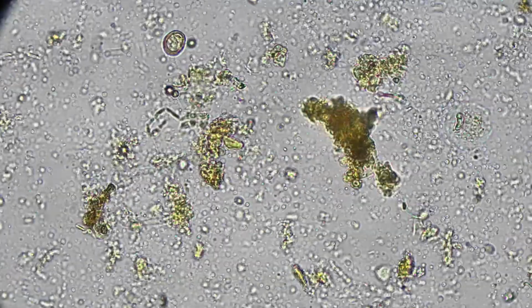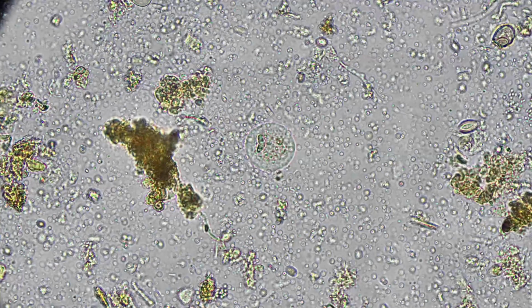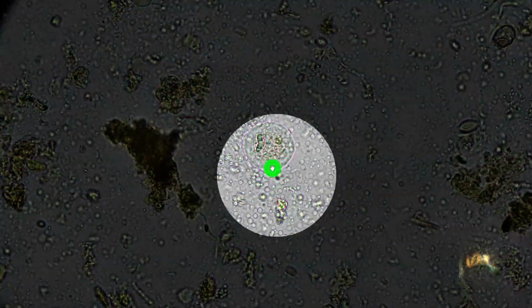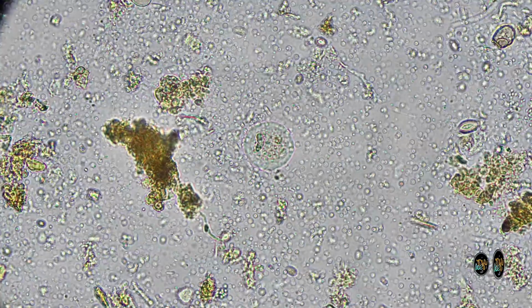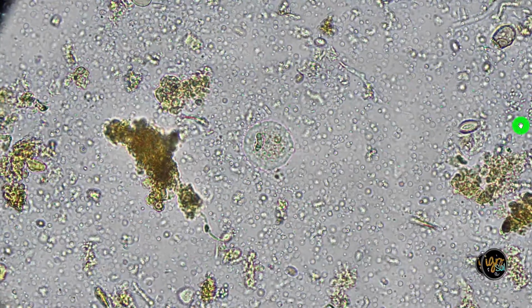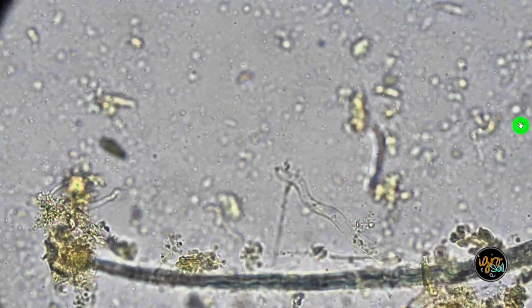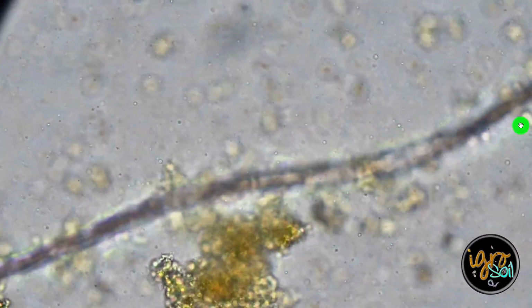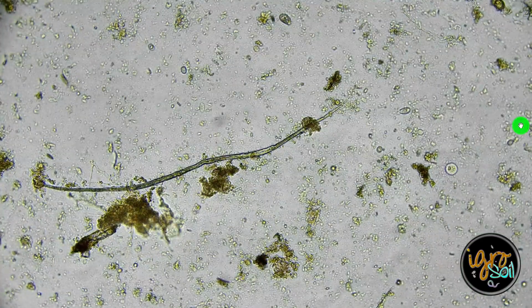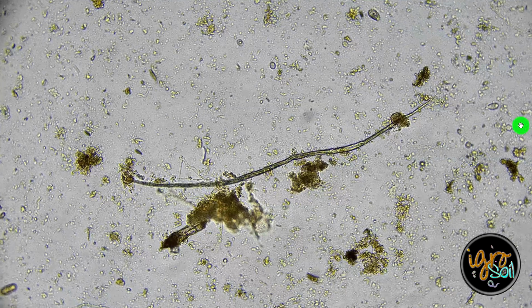Look at this. This is some type of amoeba. I mean, there's another testate. So if you had any doubts, you should clear that up. And unfortunately, what we're looking at here is probably a microplastic. You just can't get away from it.